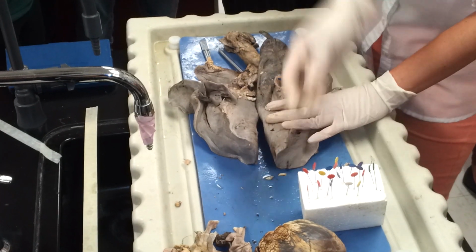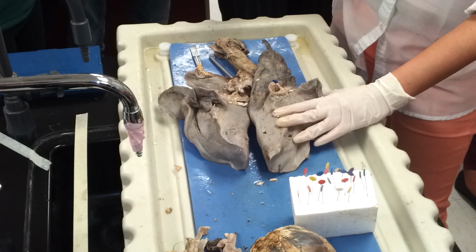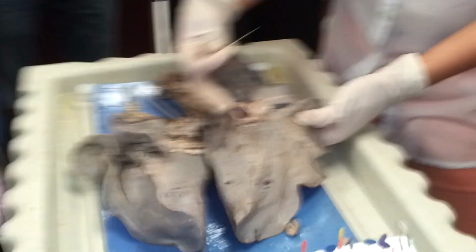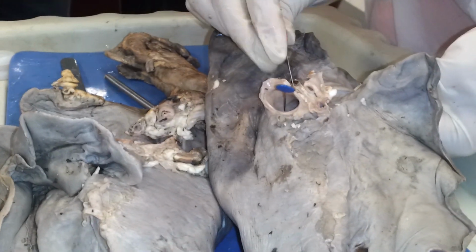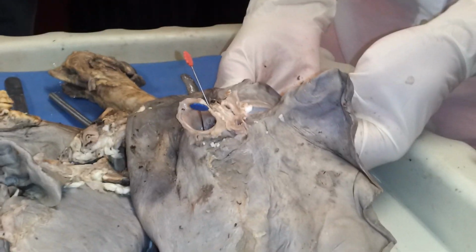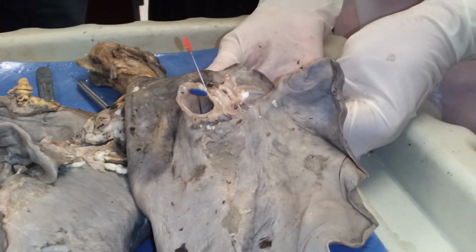Alright, now there's other vessels that we can identify. Remember from the blood vessels lecture, what has a thicker tunica media, the veins or arteries? Arteries. Arteries, okay. So even in this lung, you can see that the arteries hold its own structure because it has a thicker tunica media, right? So we find here what vessel? At the orange. Pulmonary artery. Good. Pulmonary artery. So don't forget the pulmonary part because you want to be as specific as you can. We're looking at the pulmonary artery.